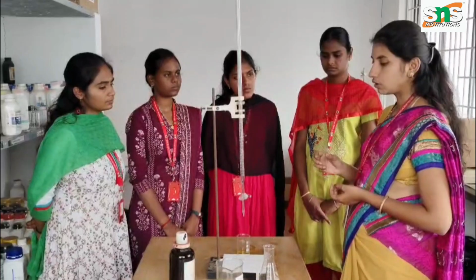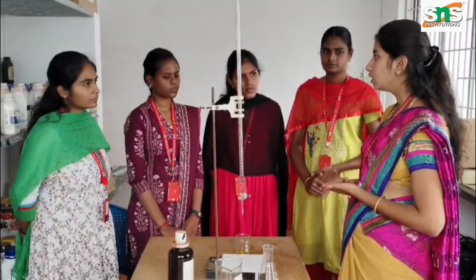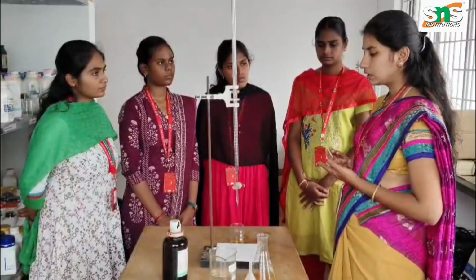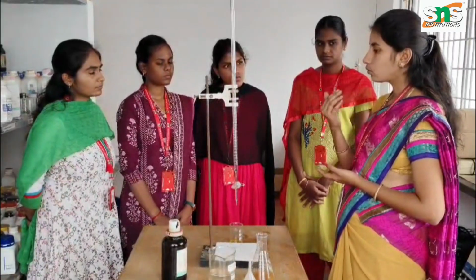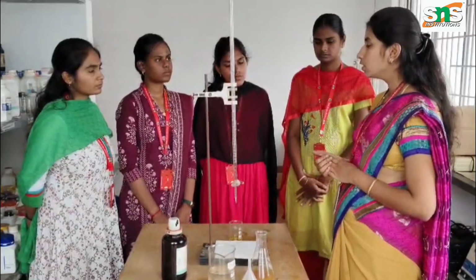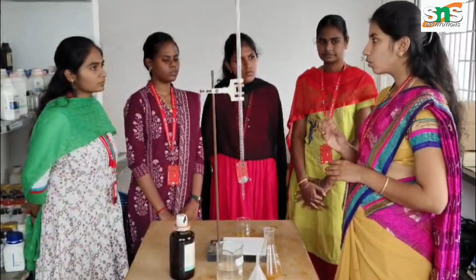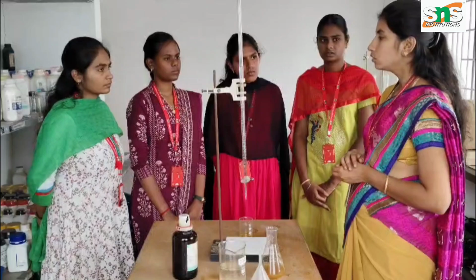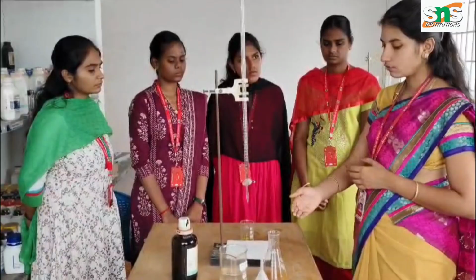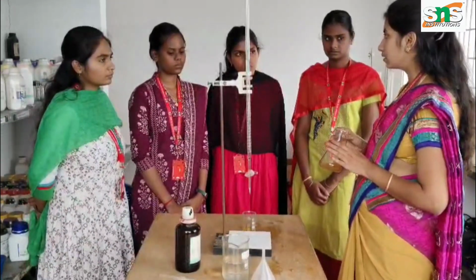So using these two values, we consider the normality of silver nitrate and the volume of the water sample that we have to identify. In this experiment we can test any other water samples, whether for industrial purposes, drinking purposes or pH, or any industrial waters or sewage waters, and we have to calculate the chloride ions present as Cl ions. Most of the water content is based on this chloride content. So how much we have to titrate with this solution gives the chloride content present in the water sample.